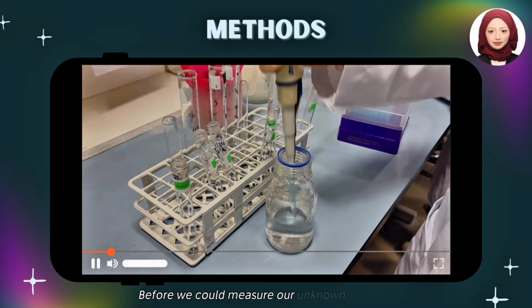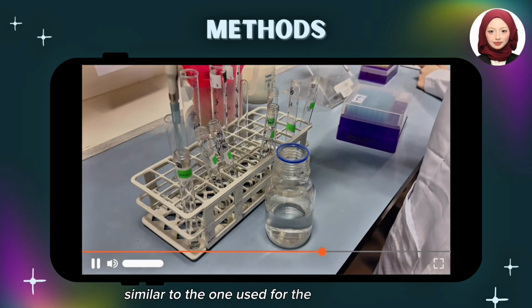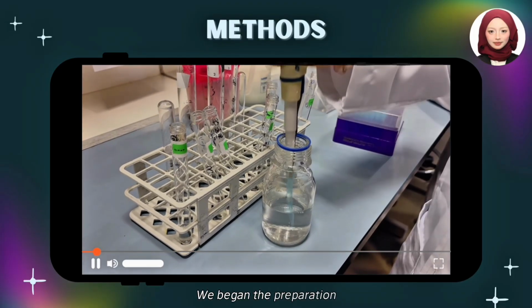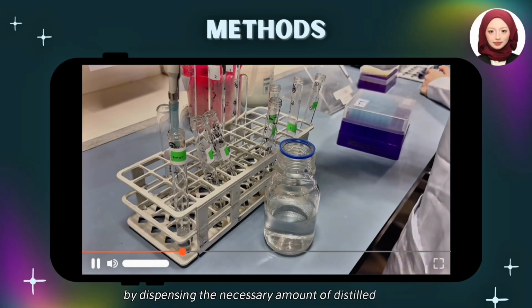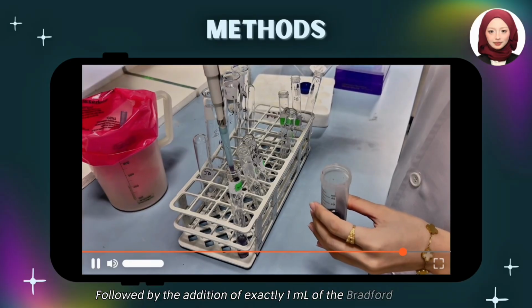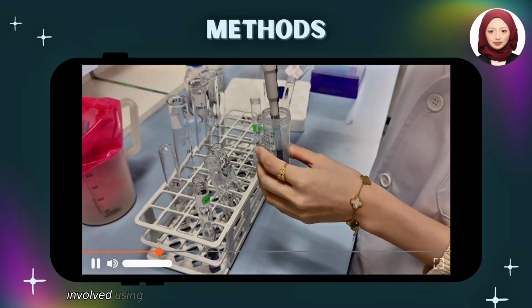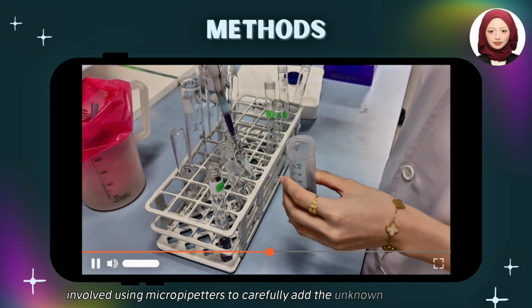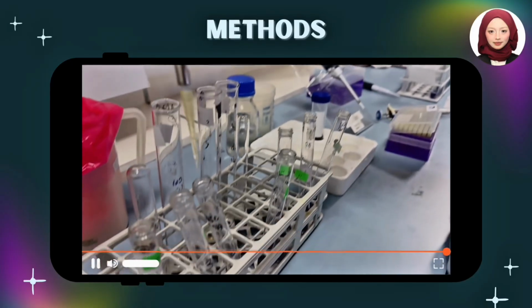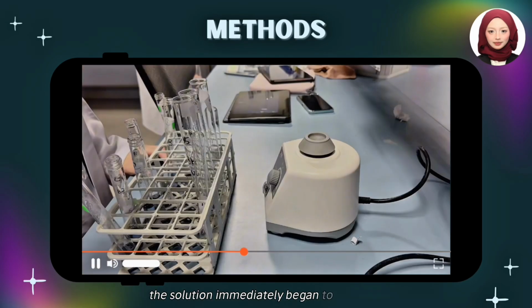The sample without protein was used as the blank to zero the machine. Before we could measure our unknown samples, we followed a standard preparation protocol, similar to the one used for the standard curve, but replacing the known protein with our unknowns. We began by dispensing the necessary amount of distilled water into our test tubes, followed by the addition of exactly 1 ml of the Bradford reagent into each tube. The core preparation involved using micropipettes to carefully add the unknown protein samples A, B, and C into the corresponding test tubes. Once the unknown protein solution mixed with the Bradford reagent, the solution immediately began to turn blue.